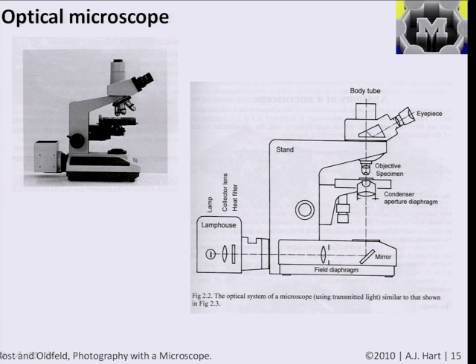And the idea here, so we can build upon it, is just you have a beam of light, and you use optics to focus that light, and you use optics to collect that light. How you introduce the light on the sample and how you design the system to magnify the image determines the resolution of your technique. The ultimate resolution is, say, a fraction of a micron in the case of conventional optics.